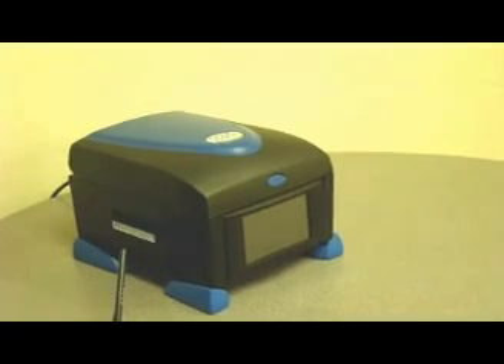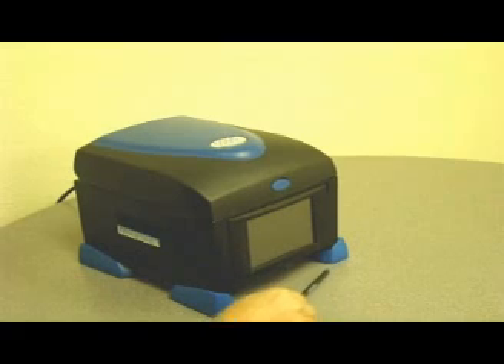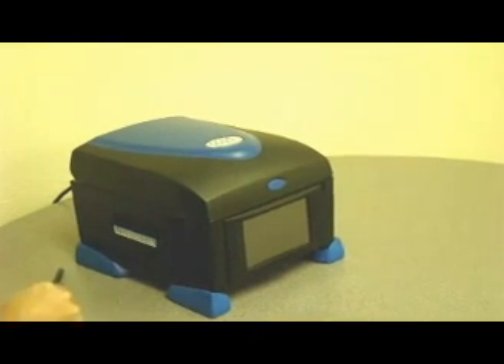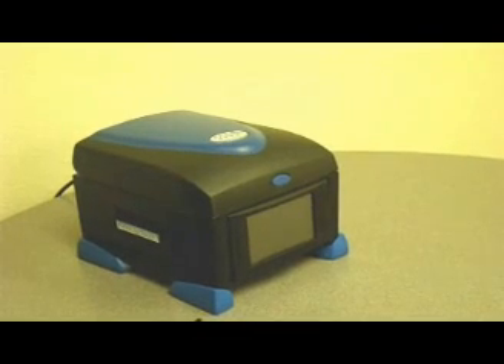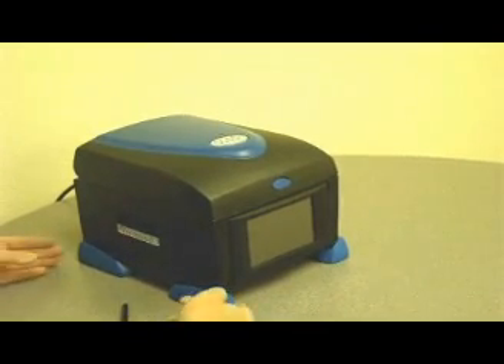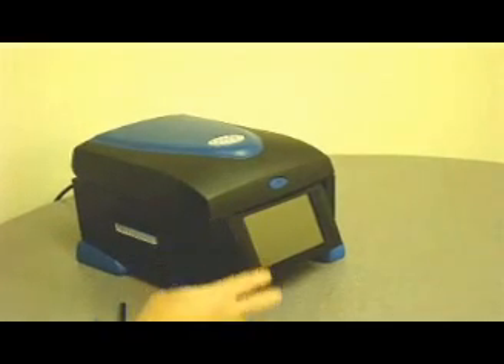Both machines are built with a space-saving design. They're only 10 inches across and 11 inches deep to minimize that valuable bench space to operate. Both units offer an adjustable viewing screen for different viewing angles.